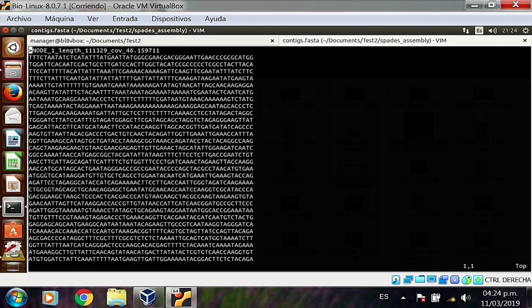So, in order to summarize this a little bit, how many sequences in total do you think there are? Should there be one sequence per name? Should each of these sequences have a different name, I mean? It makes sense, right? All of the sequences are stored in the FASTA format, each of them will have its own associated name, and all of those names will start with the greater than sign. So that's what we're going to look for.